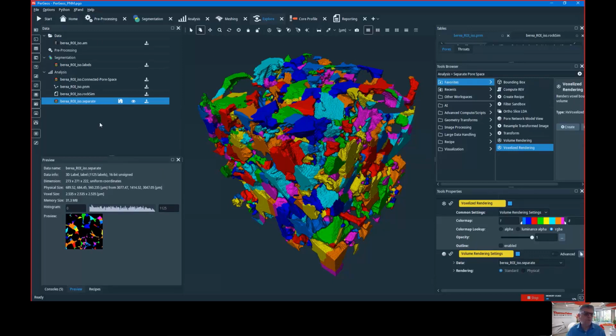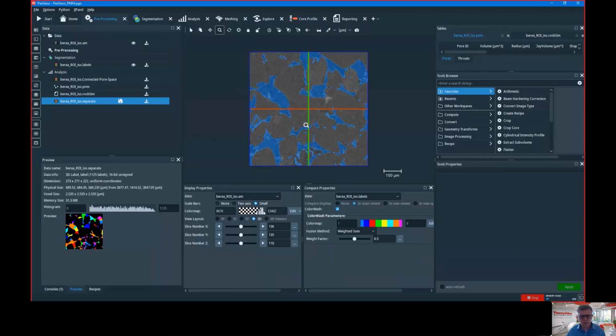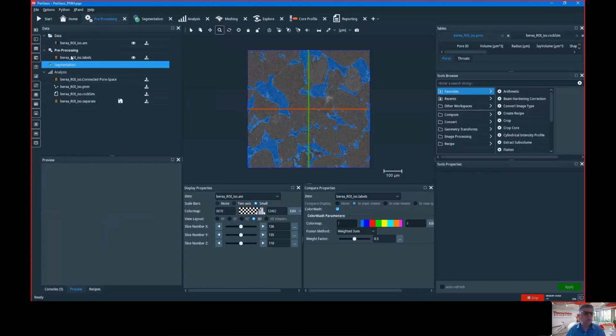First of all, you notice you don't have the network editor here because PerGeos is targeting more data. It's data oriented. So you see your data here, but you don't have specifically to attach visualization to the data. The data will show up automatically in the viewer. So it's a different way of working. When you load something, the data comes here. When you compute something, the data goes here. You can move them, of course, in different categories, but it's more project data oriented rather than network.